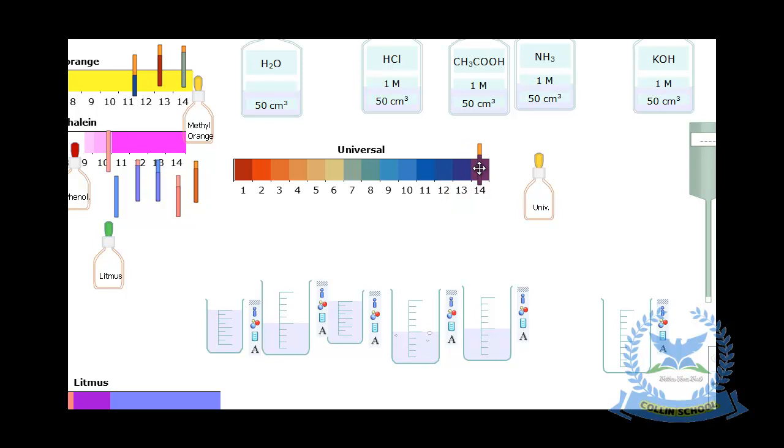So you can see this is potassium hydroxide, a very strong base, so we say that it is strongly basic, and it gives us a pH of 14.